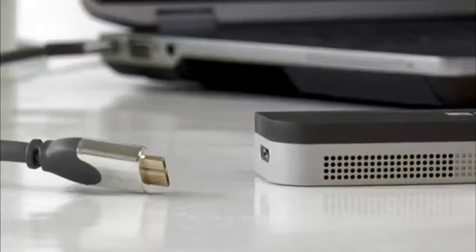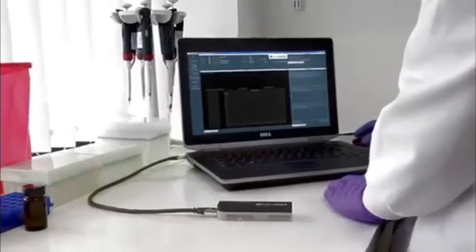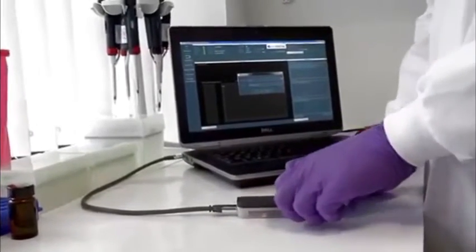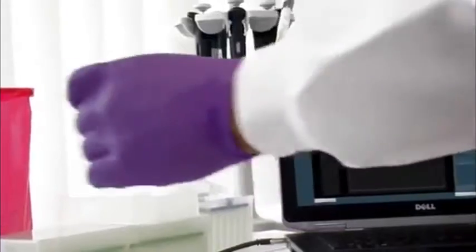The workflow for a MinION sequencing experiment is straightforward. Firstly, the MinION is connected to the laptop through the USB 3 cable. The user then launches the MinKNOW software that will run the MinION, and after performing a calibration and quality control procedure, the MinION is ready for the sequencing library.